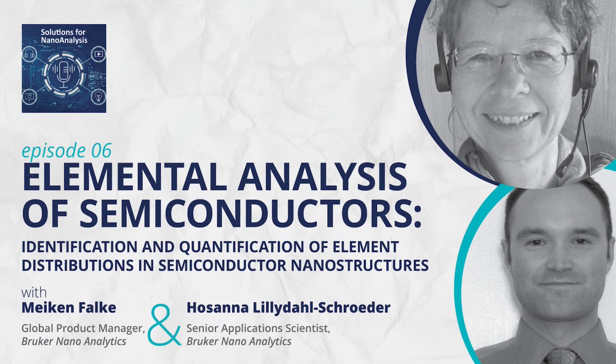On top of that, the EDS sensitivity allowed even seeing the bumps in the EDS background, which are caused by coherent Bremsstrahlung. So this paper is something I do recommend to everyone who is serious about analyzing semiconductor materials.